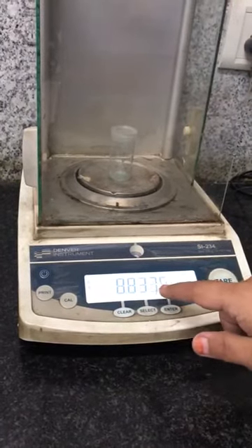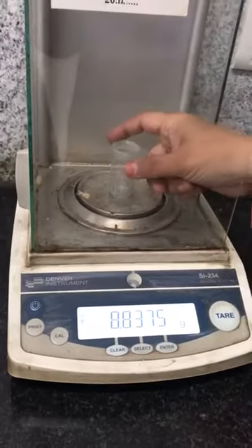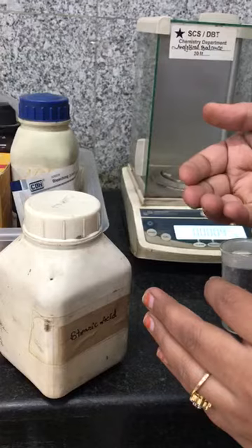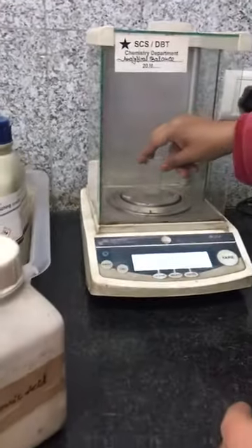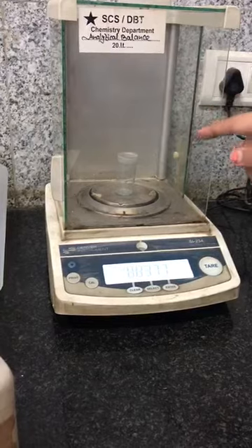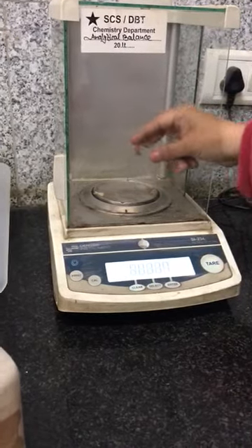Don't write something like 8.83 — you have to note down the complete reading. After taking out this bottle, take the chemical you have to weigh. Pour it completely into the weighing bottle — whether it's a loose chemical or from a packet. Then place the weighing bottle back inside and take the weight again — the total weight of the bottle plus your salt.